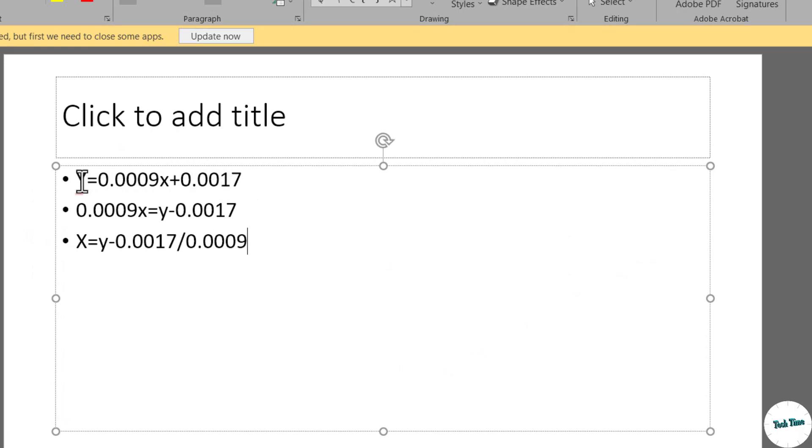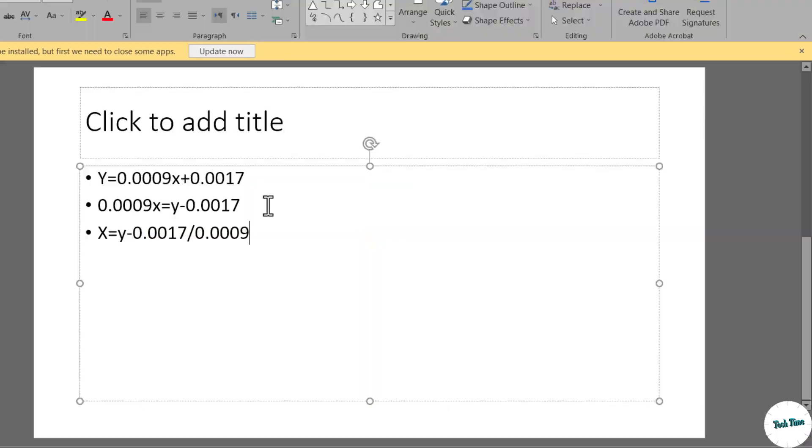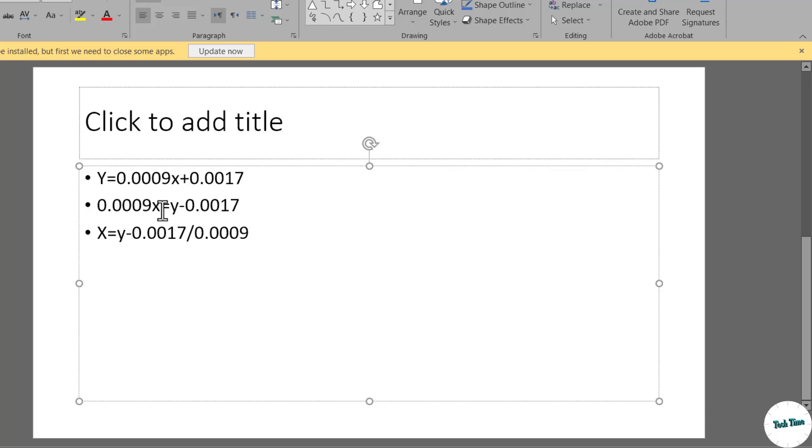Since we have already calculated the value of y over here, now we have to find out the value of x. Simply rearranging this equation like this: bring this 0.0017 towards right. The equation will become y minus 0.0017 equals 0.0009x. Now to find the value of x, we can simply divide this particular right hand side part by 0.0009. In this way we can calculate the value of x.